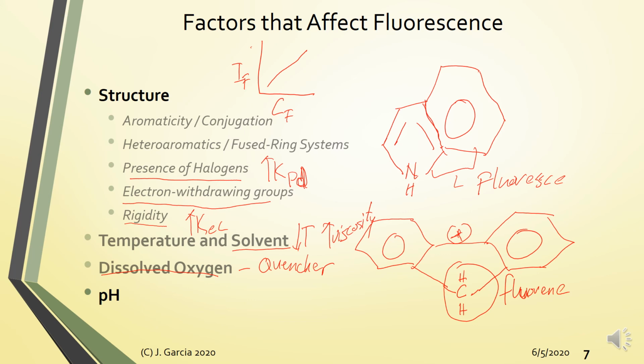First, you have a fluorescing material whose concentration is constant. So fluorescing material, fluorescence intensity. Since the concentration of these different solutions is constant, you expect a flat profile.